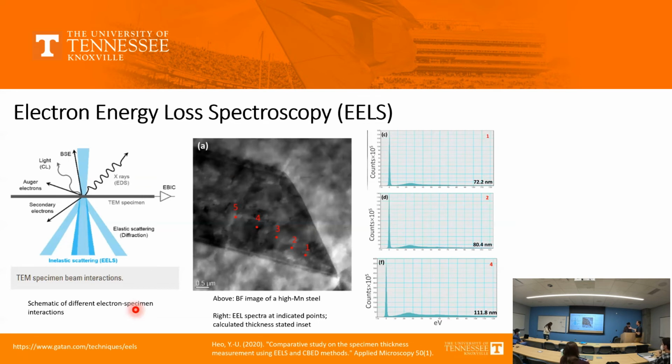And if you're trying to use TEM to calculate something like precipitate number density, which is a key parameter for nuclear materials as far as sink strength, you can introduce huge error if you're not carefully accounting for your sample thickness precisely in some way, whether it's by this or with CBED.